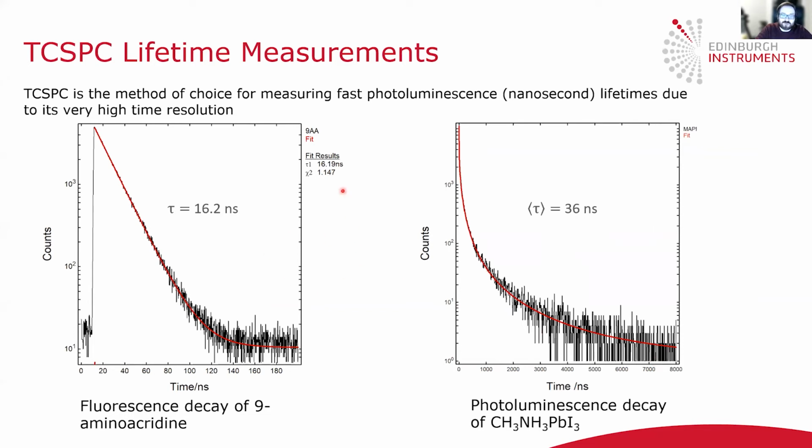An example of TCSPC in use is shown here. So this was a decay of an organic molecule, 9-aminoacridine, which shows a nice mono-exponential fluorescence decay with a lifetime of 16 nanoseconds.